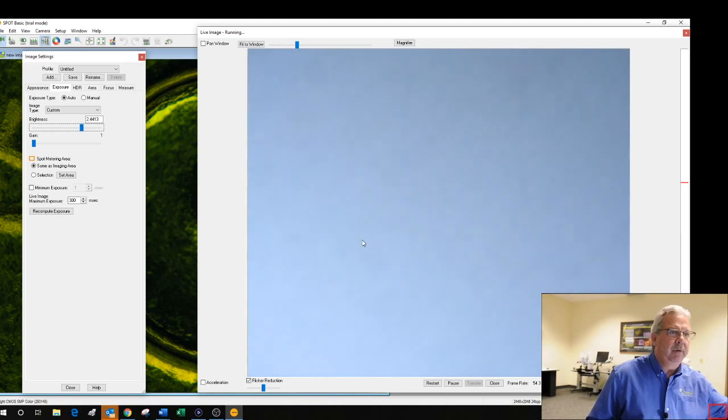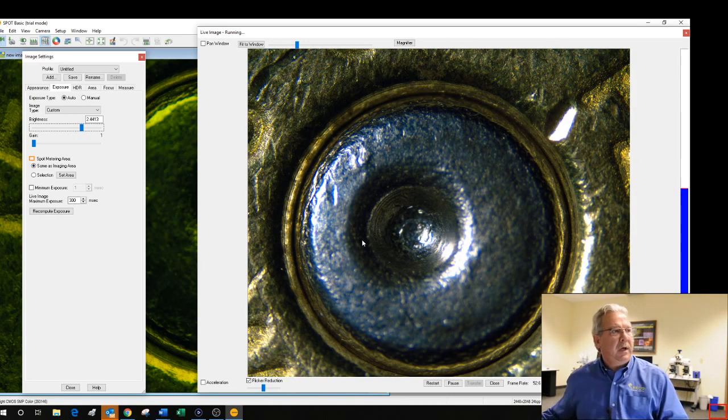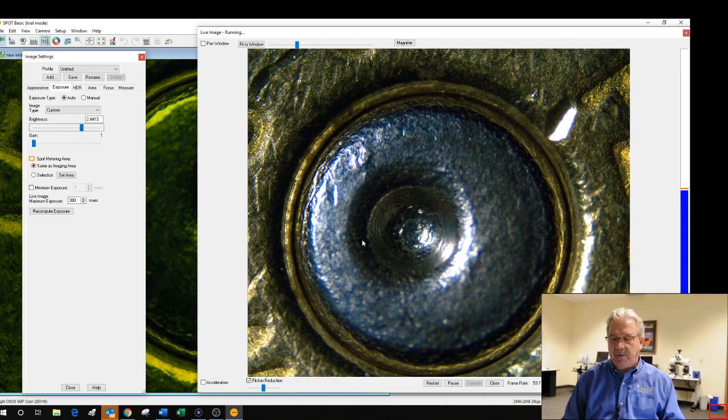And if I go put a white card under the side that's illuminated with the LED fiber optics, what we end up with is not a white card, but a blue card. So maybe you don't use the fiber optic light so often, and for that you could just white balance when you get there. I prefer a little different solution, and I like to create image profiles.